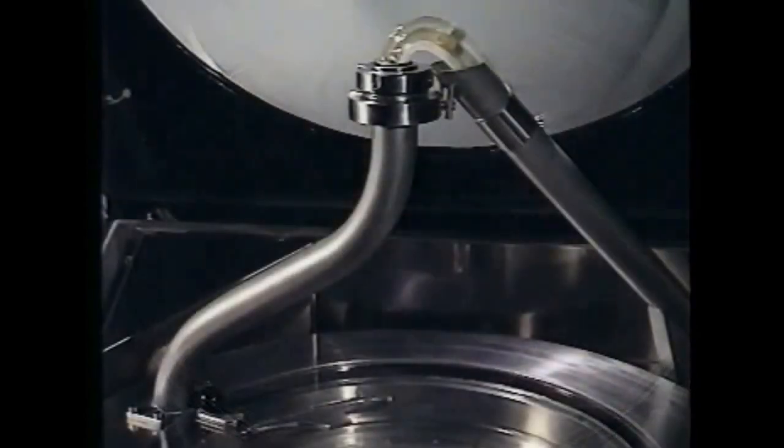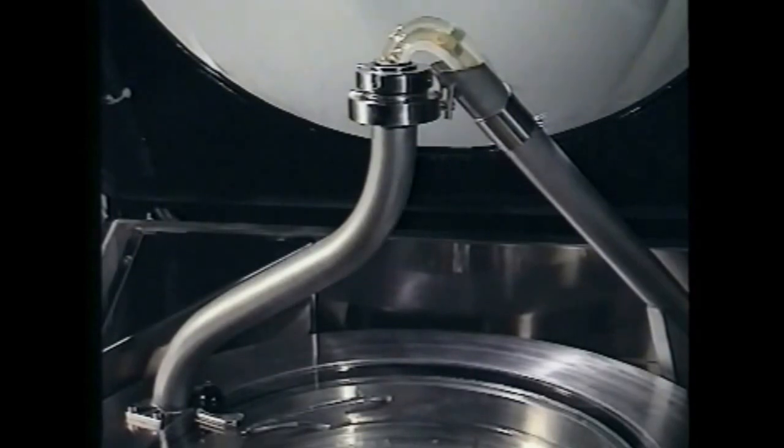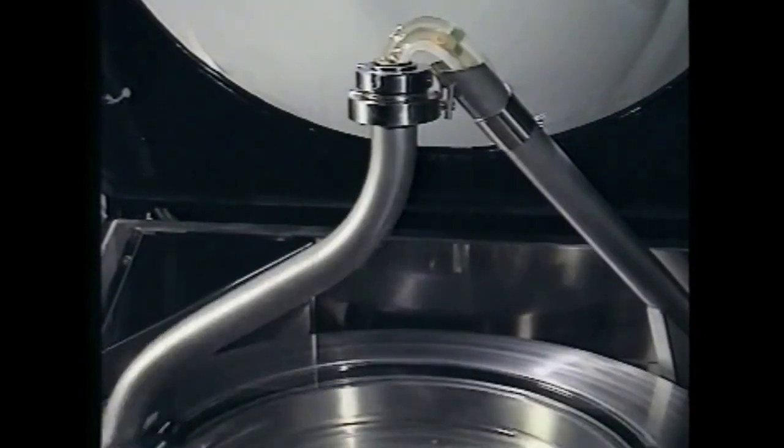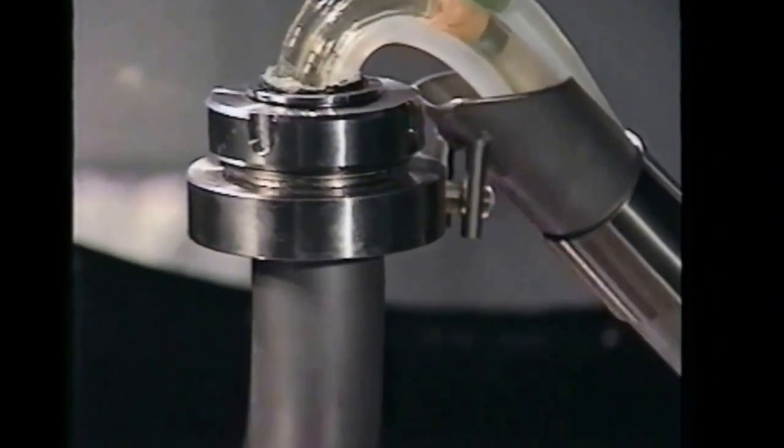The tubes are fed through a specially shaped guide pipe, the inverted question mark. This shape has one very important property. While one end of the tube remains totally stationary, the other end can rotate at high speed.